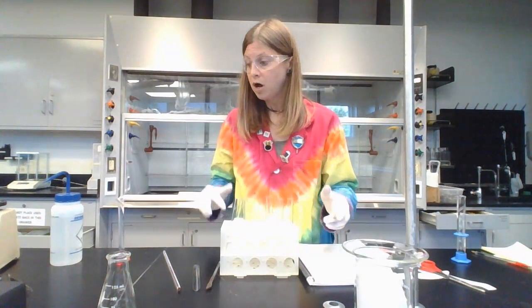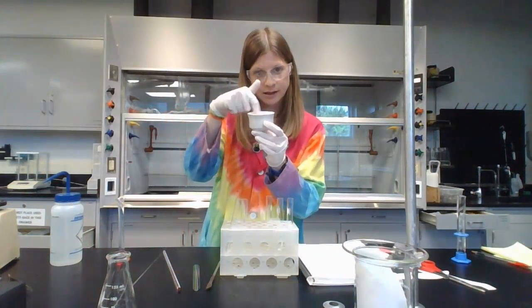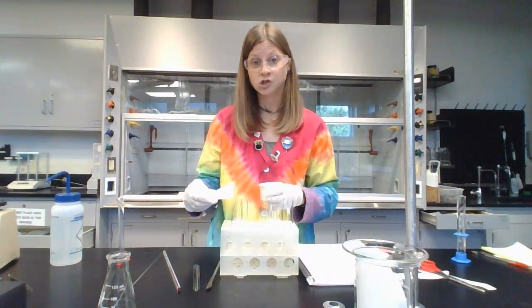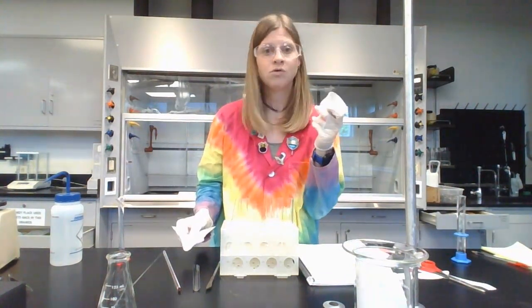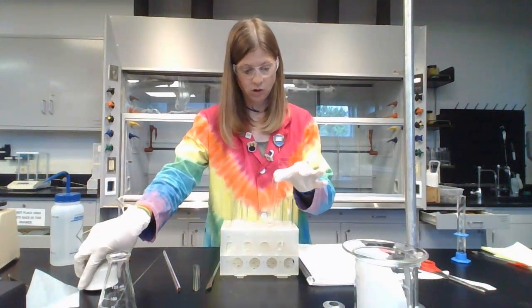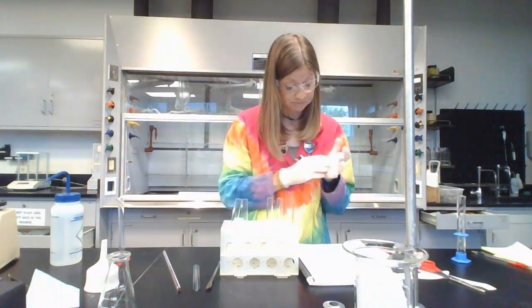And then you're going to take your product, which is going to be whatever leftover junk is still in here. Hopefully 0.01 grams of it are still in there. And you're going to measure out the mass of that and then pour it into the 3rd test tube. Let's say you couldn't get 0.01 grams out of this. Then you're going to have to go in the oven and steal a little bit of your solid that's drying until you have 0.01 grams. Okay, put it into a test tube. Okay, so now you have 3 test tubes: salicylic acid, aspirin, and the thing that you made.